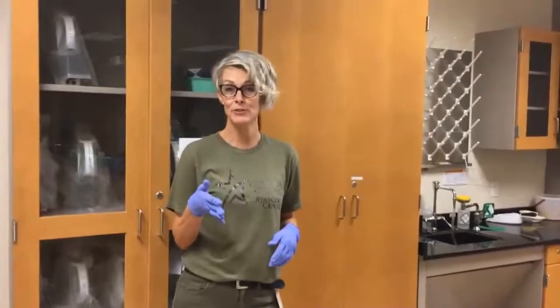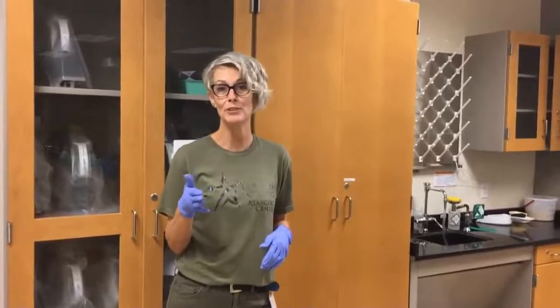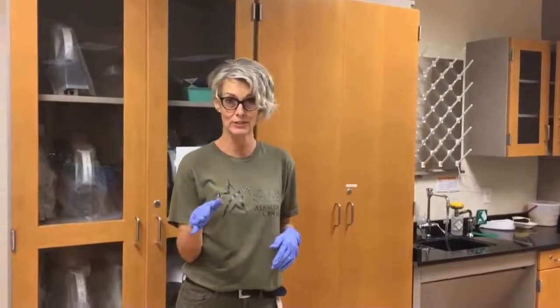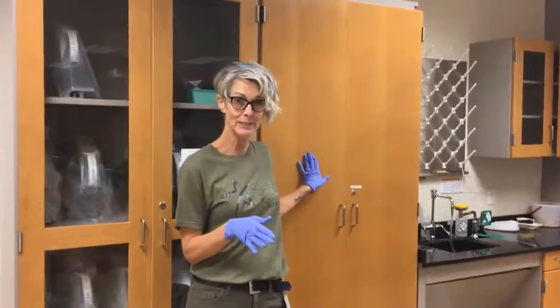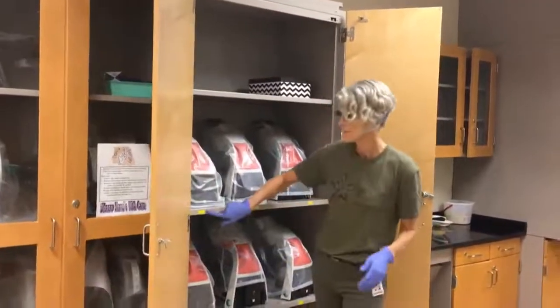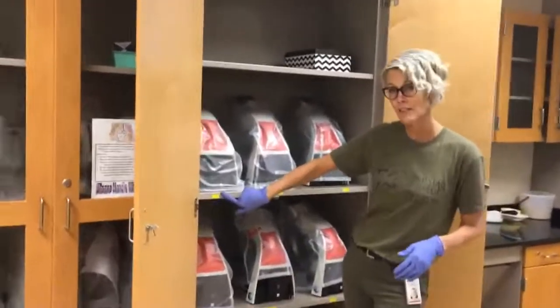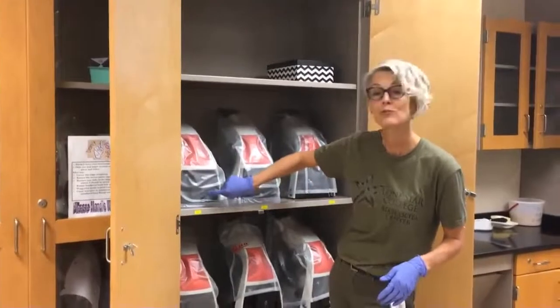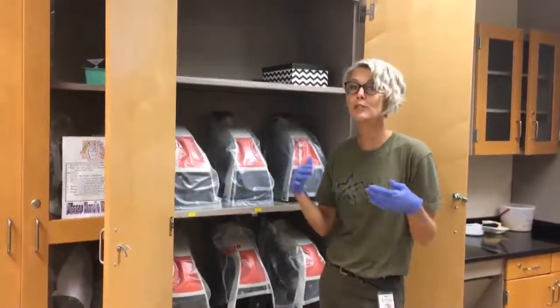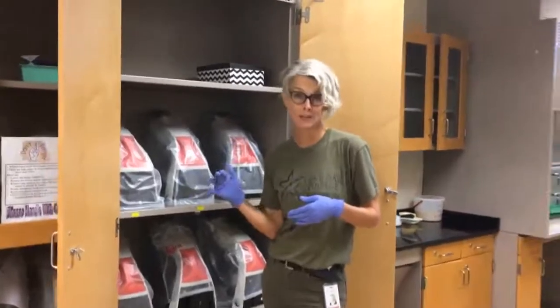You're going to be assigned a microscope, and microscopes are given numbers that are going to correspond to your seat number or whatever is told to you by your instructor. Our microscopes are kept in a cabinet, and the cabinets are numbered. There's a number on the shelf that's going to correspond to the microscope. This is where you're going to get your microscope and also where you're going to return it for the entire semester.